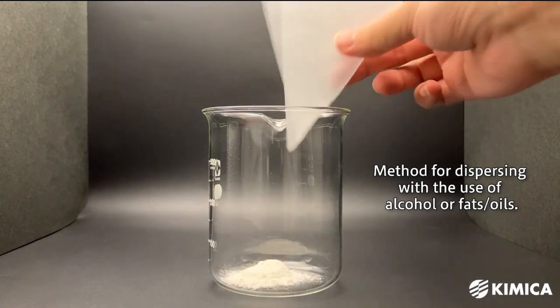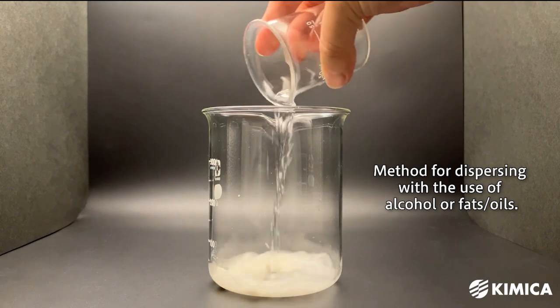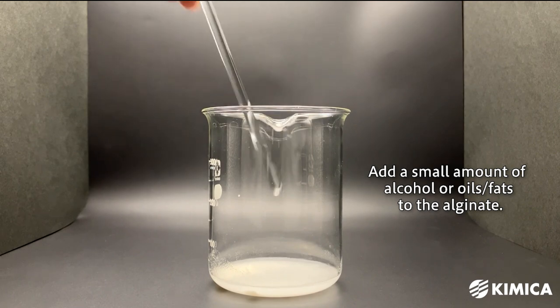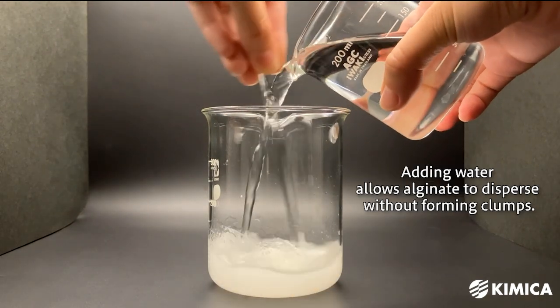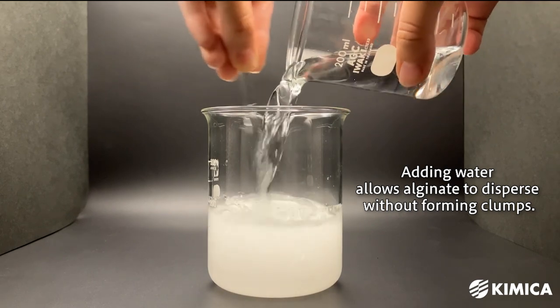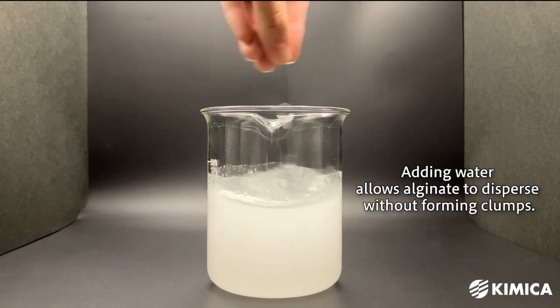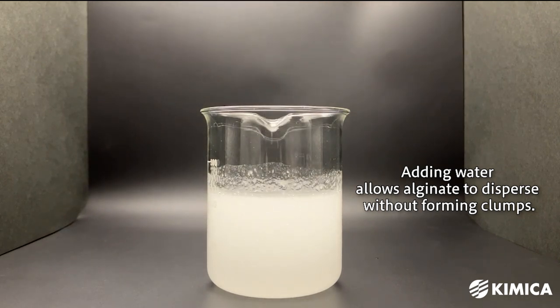Additionally, we would like to introduce a method of dispersing using alcohol or oils. Add a small amount of alcohol or oil to the alginate powder — alginate does not dissolve in alcohol or oil. Add enough to make the entire powder damp and free-flowing. Then pour water into the mixture all at once. The alginate will disperse without forming clumps, and gentle stirring will allow you to obtain a uniform water solution.